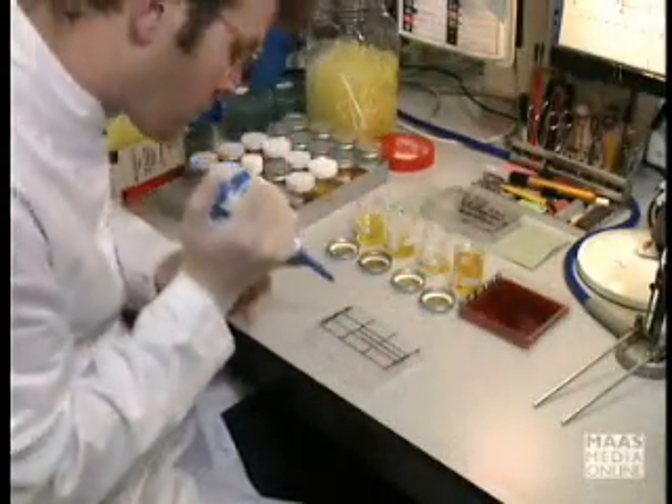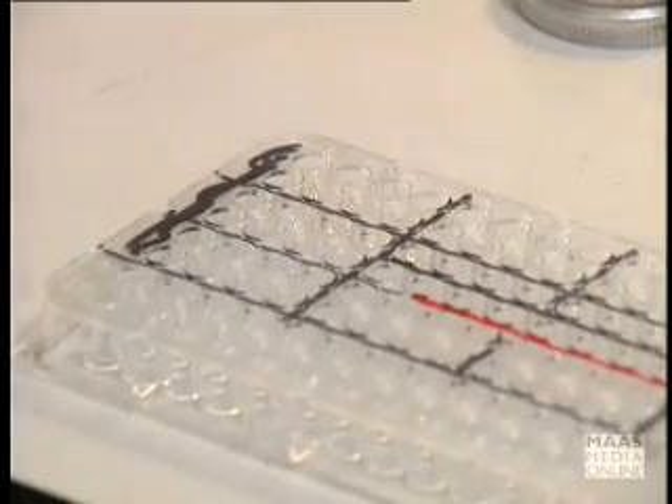In the laboratory, a small sample of the urine is transferred to a micro-well for microscopic examination.